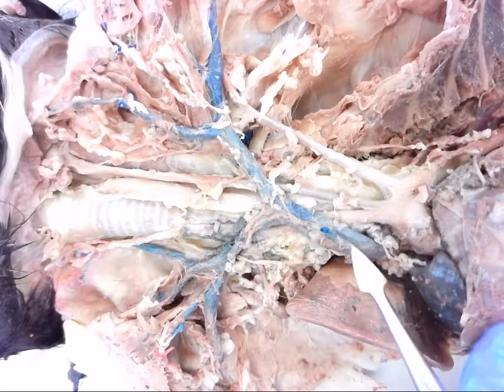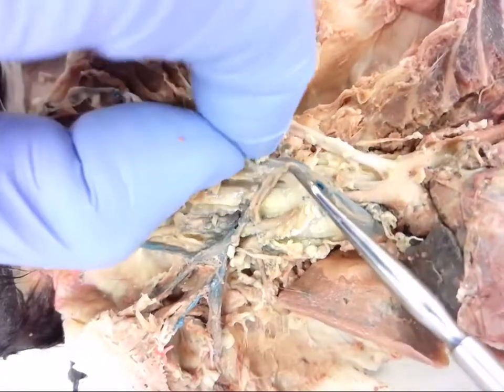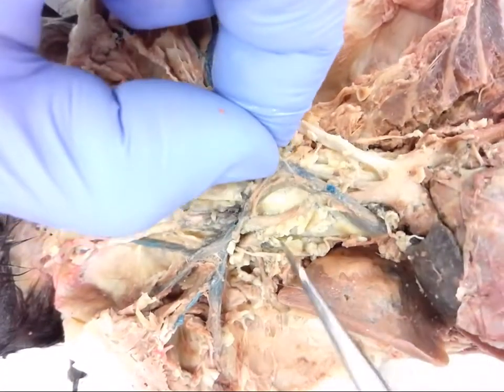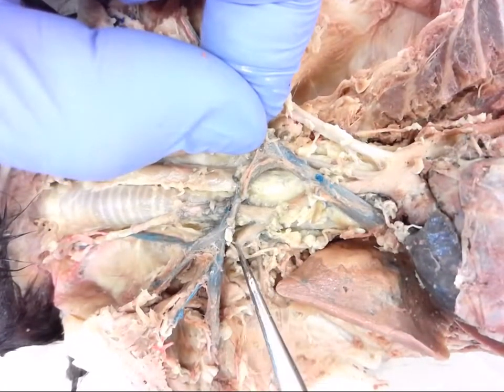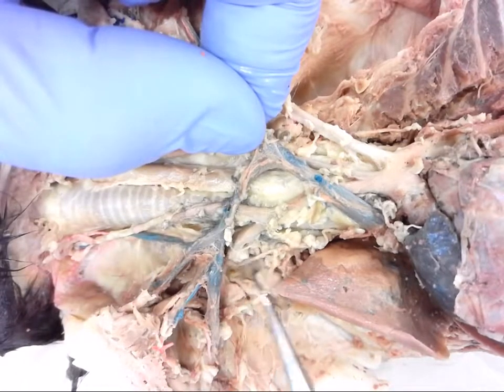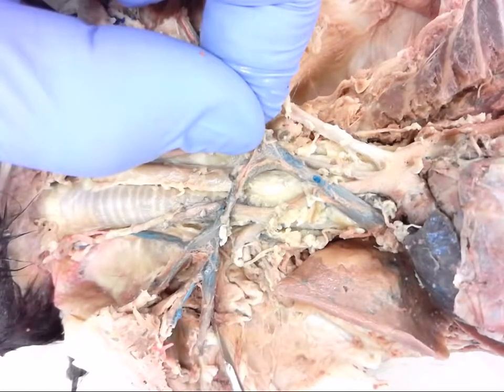Okay. And then if we get our veins out of the way, actually I'm going to move them up, you'll see that the brachiocephalic comes up here. It's a little bit longer than normal in this specimen. And you'll see that there's a branch here and a branch that goes up here. So this is the right subclavian, and it's going to go down to the arm.